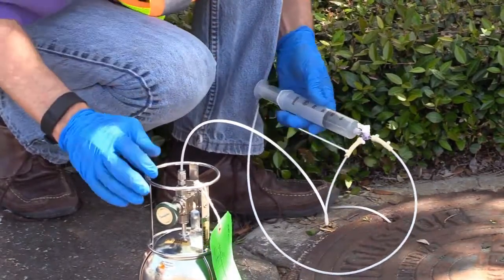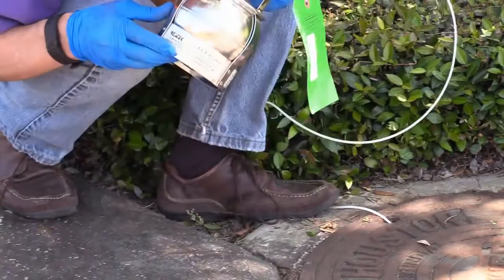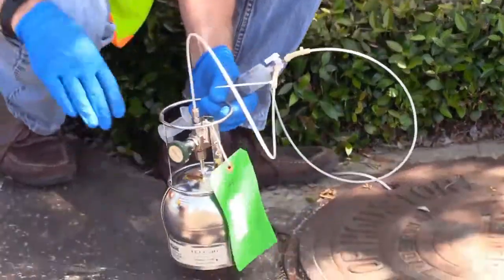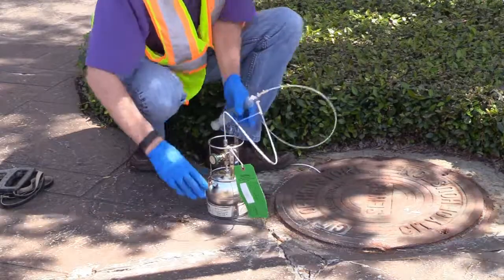After connecting the SUMA to the sample point, open the valve on the SUMA to collect the sample. The flow of vapor into the SUMA is usually audible. If collecting a grab sample, i.e. no flow controller, allow the SUMA to fill for 30 to 60 seconds.